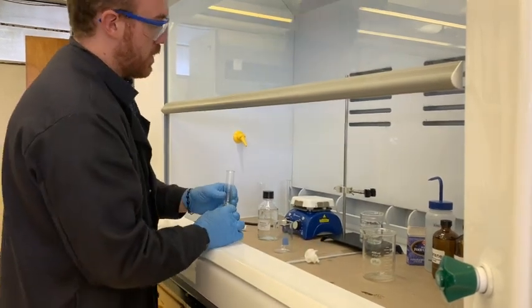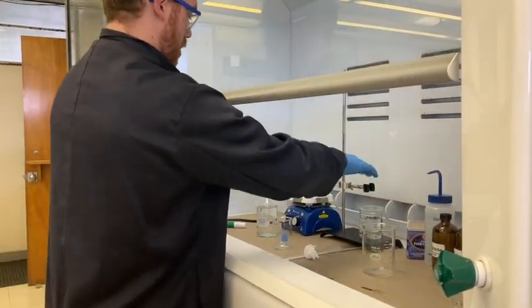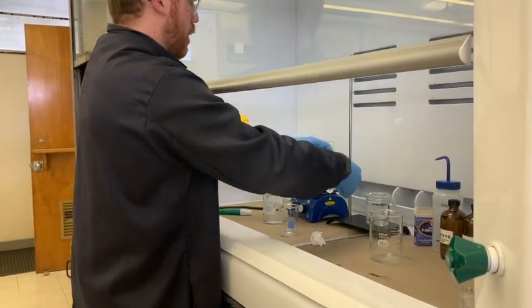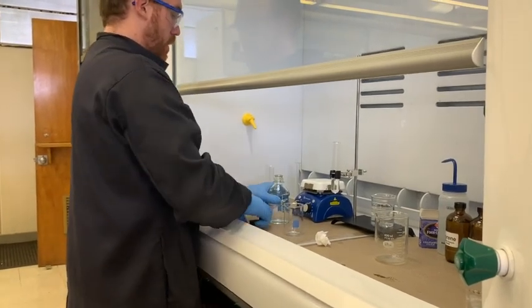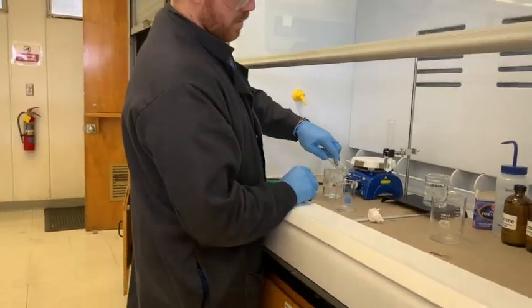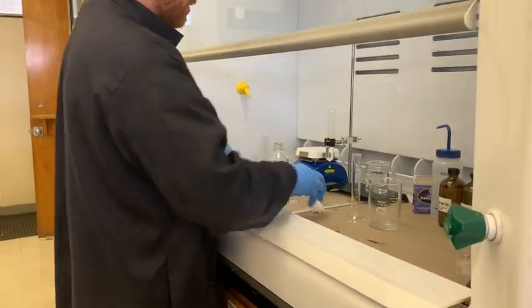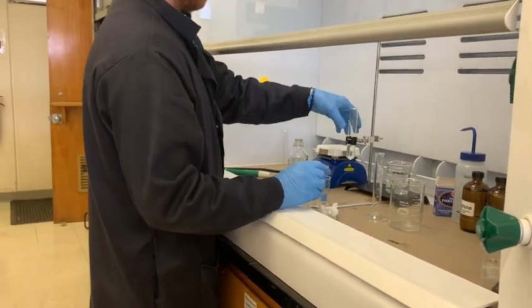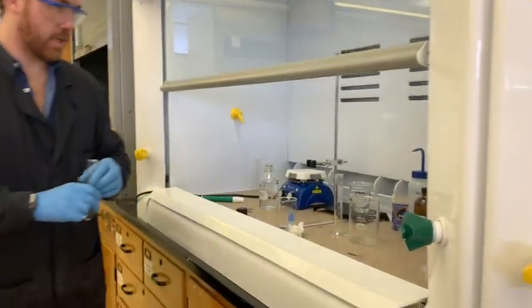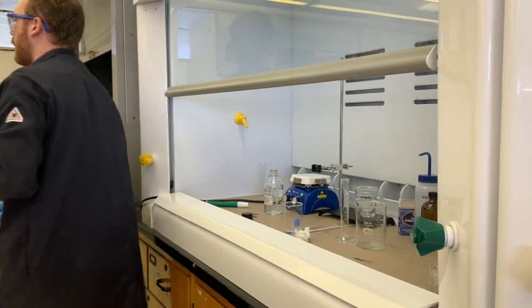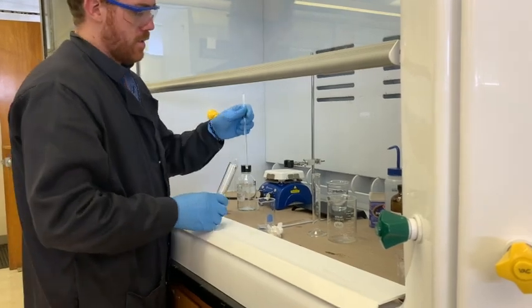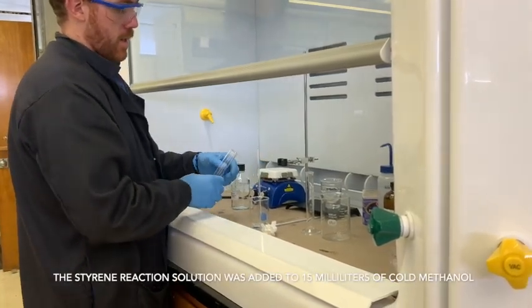And then we are going to mix that in with some methanol over here. So this methanol is slightly cooled. It's chilled from another experiment. I'm going to put 15 milliliters of that. Now we are going to try to precipitate this polystyrene out of this solution. So you want to be stirring constantly once you get going. I'm going to grab the stirring rod. I'm going to combine this. And it gets to stirring.